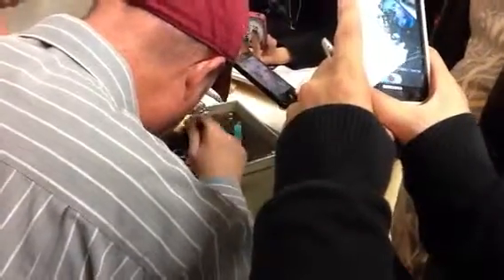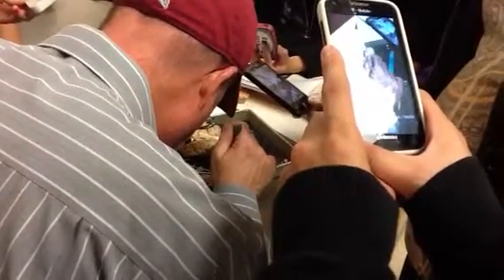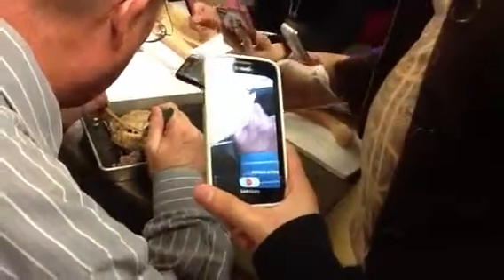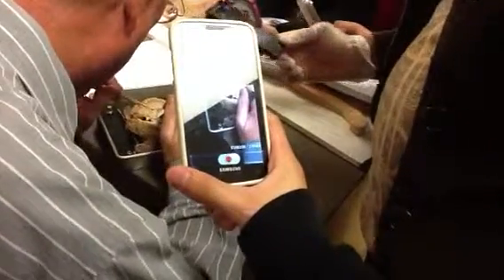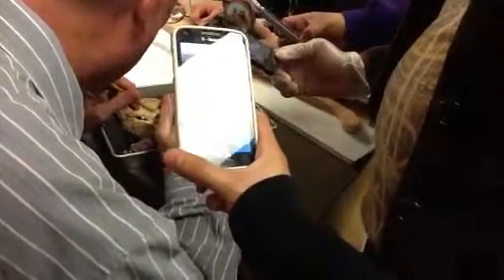And the hypothalamus is, let's see, right there. Hypothalamus is right there. Pituitary gland is right here. I'm trying to zoom in. I'm recording on this phone too. That's the pituitary gland. Yeah, pituitary. Then we talked about the third ventricle, which is right in here, and the fourth ventricle down in there. It's right actually in there.